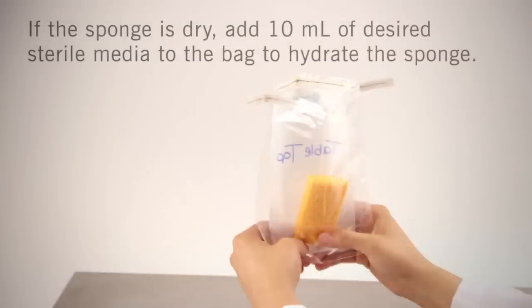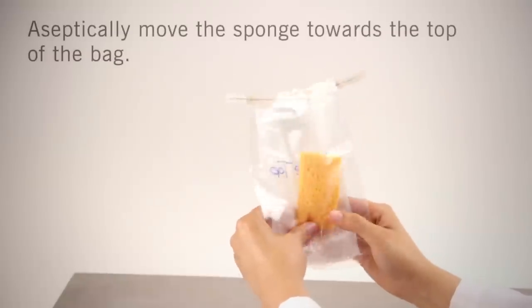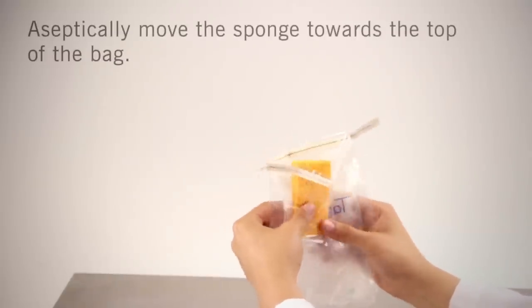If sponge and bag is ordered dry, add 10 milliliters of desired sterile media to the bag to hydrate the sponge. Holding the outside of the bag, aseptically move the sponge towards the top of the bag.